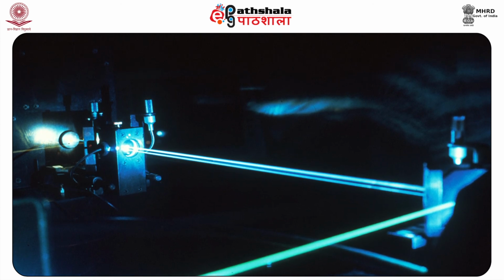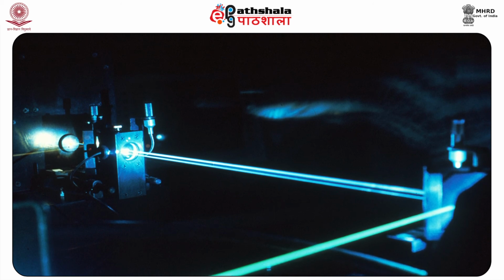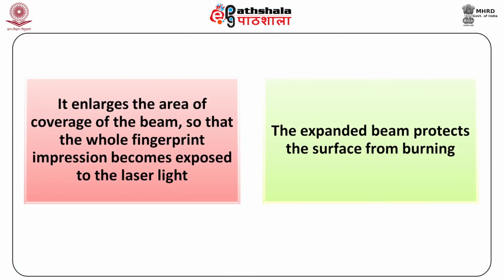Before it strikes the surface, the beam is made to pass through a lens. This serves two purposes. Firstly, it enlarges the area of coverage of the beam so that the whole fingerprint impression becomes exposed to the laser light. Secondly, the expanded beam protects the surface from burning.